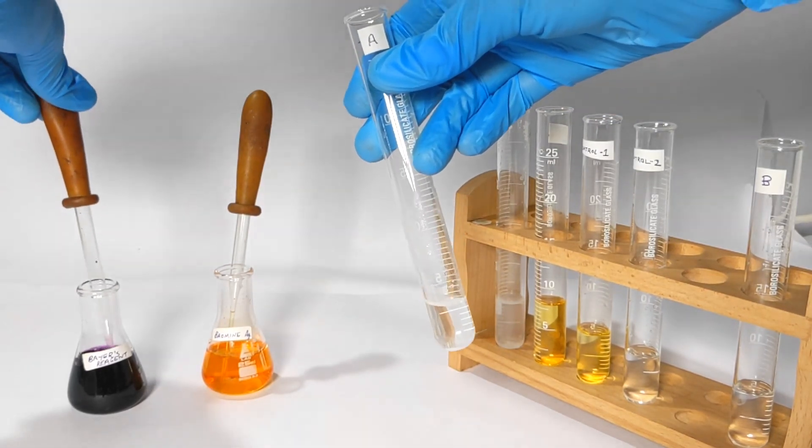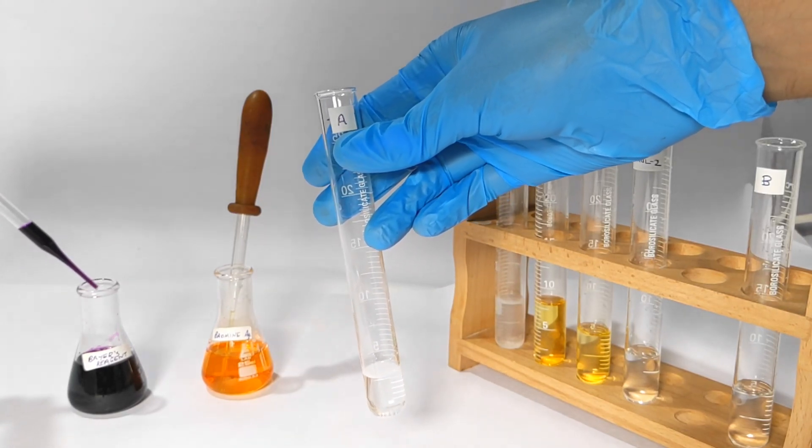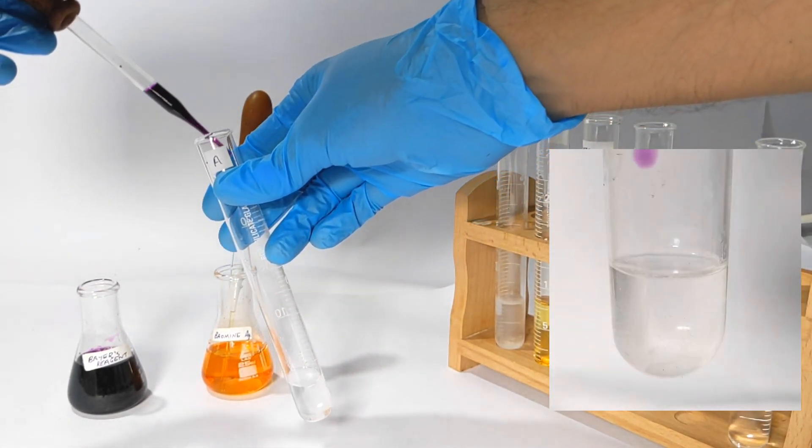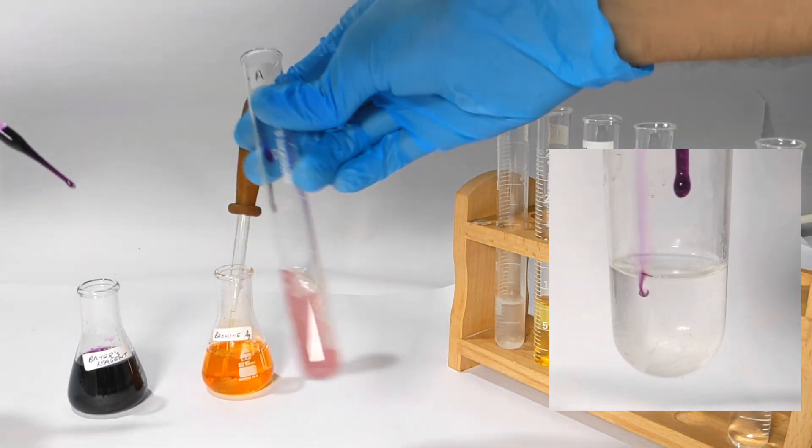Now similar to what we did in the first test, we will take some Bayer's reagent and add it to test tube A. You can immediately see the purple color of the Bayer's reagent is decolorized and the solution turns cloudy brown in color.